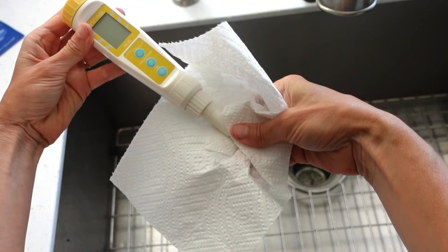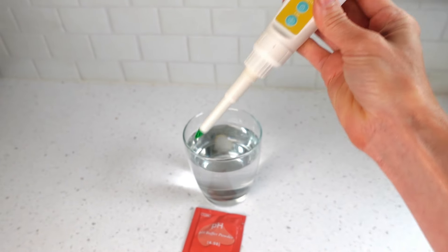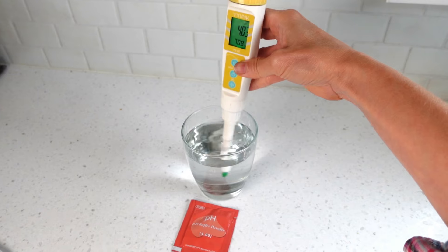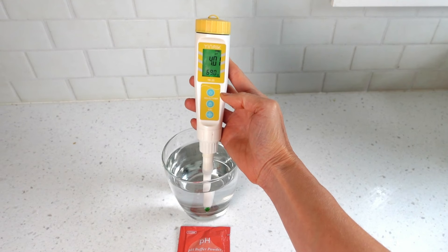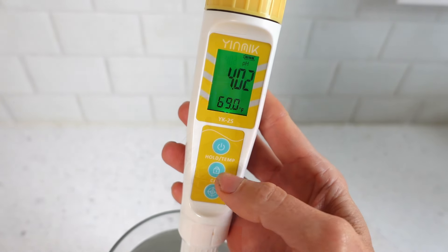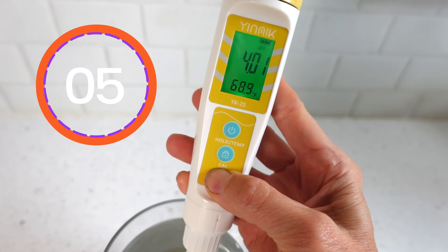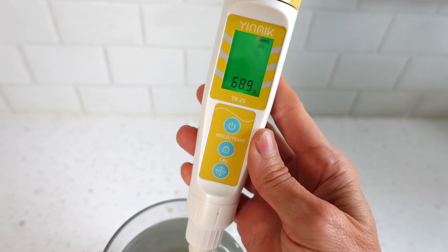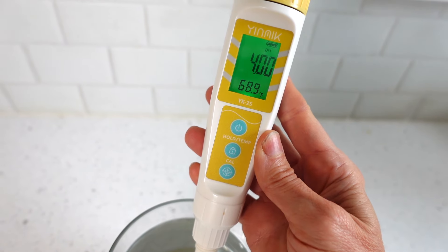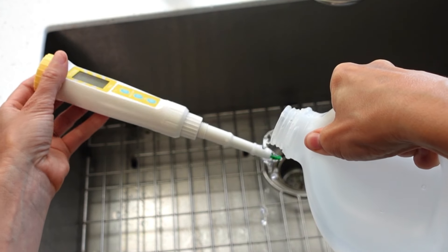Next, calibrate the orange 4.0 solution. Turn the meter on, place it in the solution and give it a swirl for a few seconds. Hold the meter still for a moment until the pH stabilizes. Press and hold the calibration button for five seconds, then release. The display flashes, then complete. Power off. Remove from the solution, rinse, and dry.